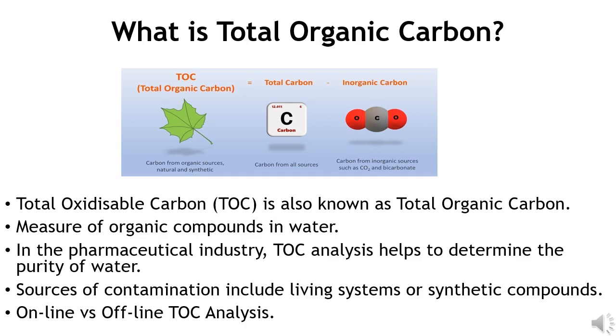What is total organic carbon? TOC is a common acronym for total oxidizable carbon, also referred to as total organic carbon. Total organic carbon is the measure of the level of organic molecules or contaminants in water.